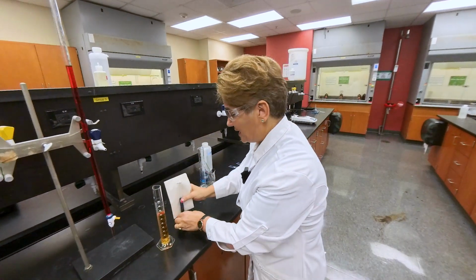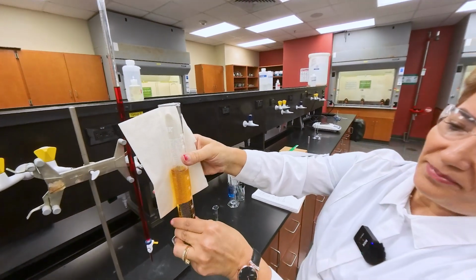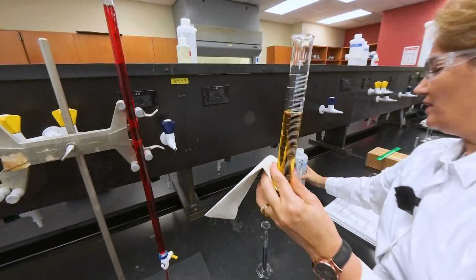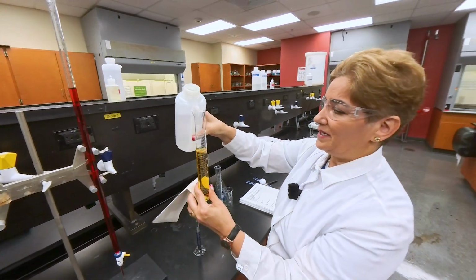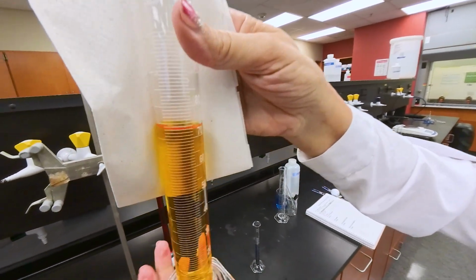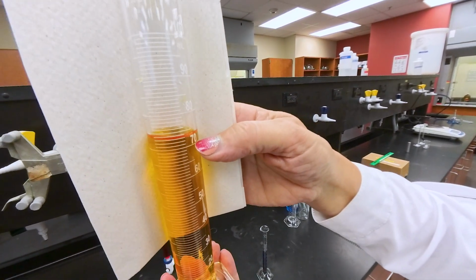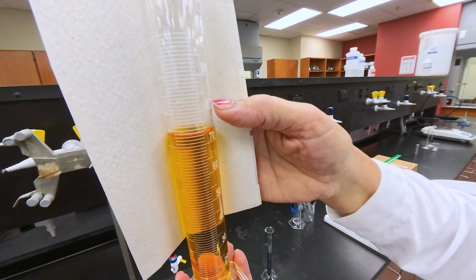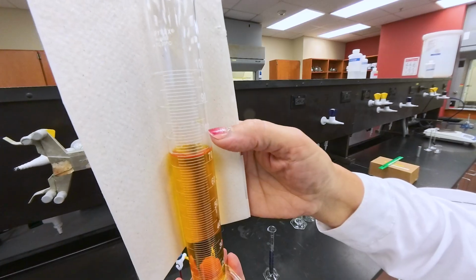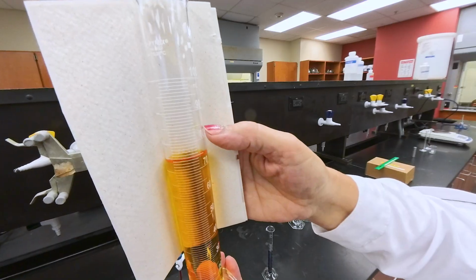Now, if I'm using a 100 milliliter graduated cylinder, the idea of measurement is the same. So if we have this level of the liquid, okay? The level of the liquid in this case, and I'm going to change it so it's not exactly at 70, so you can do the estimation. So this level, again, we are looking at the meniscus, is definitely between 70 and 80. But the device is providing me smaller units, and each unit here is 1. Between 70 and 80, there are 10 milliliters. So each one of these lines would show 1 milliliter.